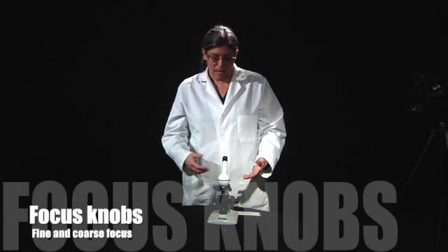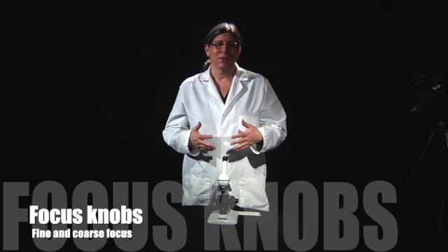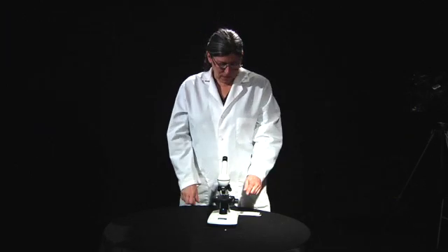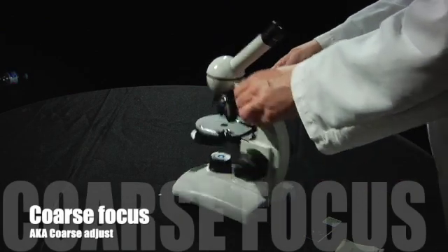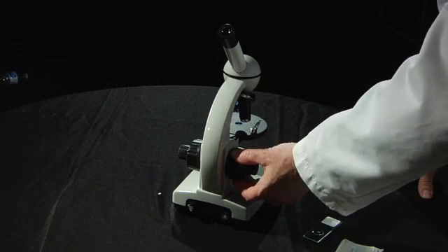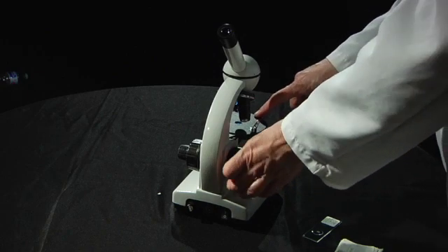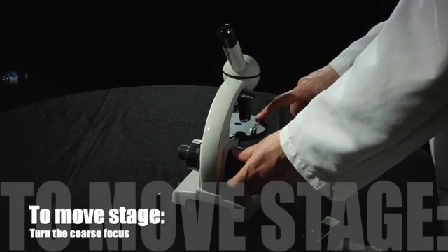The last thing we're going to learn about before we actually use the microscope is the focus knobs. There are two focus knobs: one is called the fine focus and one is called the coarse focus. You can find the fine focus on either side of the microscope as well as the coarse adjust. When I turn the coarse focus knob, both the fine and the coarse focus turn together. You might also see that the stage is moving when I turn the coarse focus — the stage moves up and down and that's how we get the slider focus.